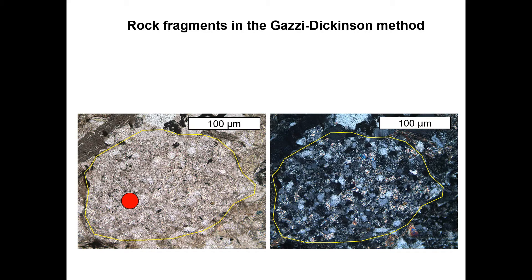Here's another example. The crosshairs landed on this around 200 microns large grain. However, the individual minerals are smaller than the 63 micron threshold. In this case, we count the grain as a whole. This is a sedimentary or a semitic lithic fragment and therefore belongs to the L-pole.